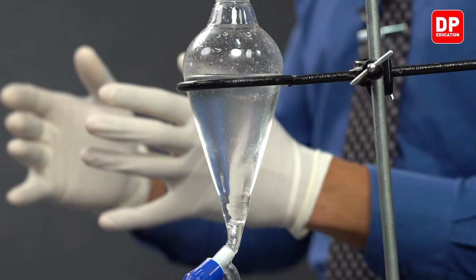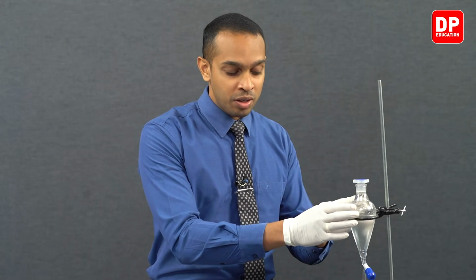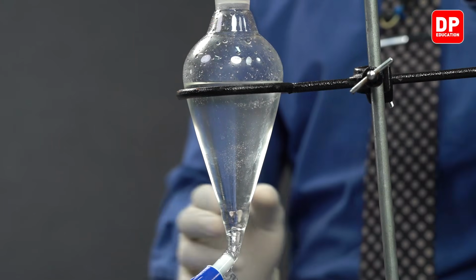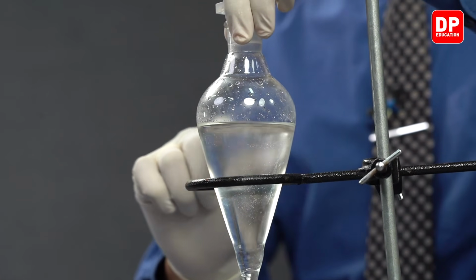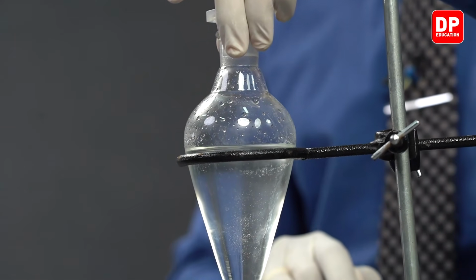This is because the immiscible oil that was mixed in the aqueous layer is now dissolved in the organic solvent that we added, which is diethyl ether. So as it is dissolved in the diethyl ether, you can see the aqueous layer is starting to clear up. And since we added a very small amount of diethyl ether, we have a very small layer of diethyl ether at the top of this aqueous mixture.